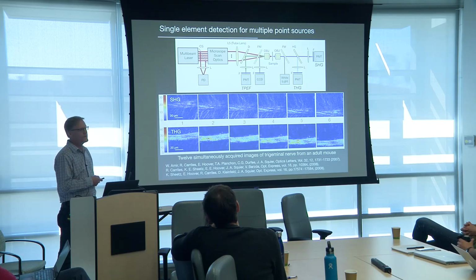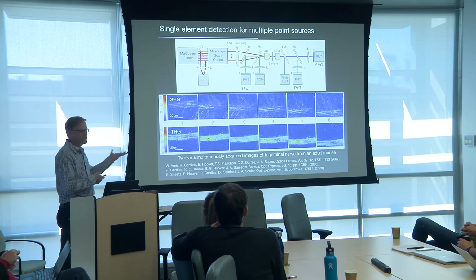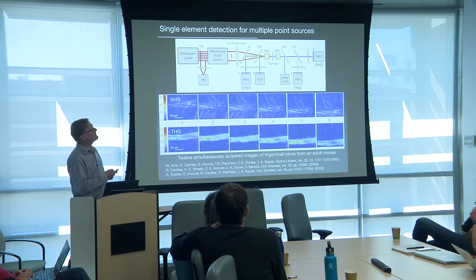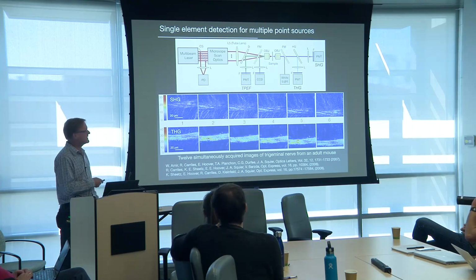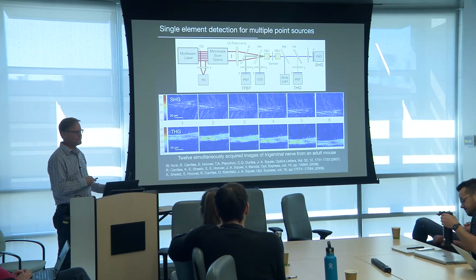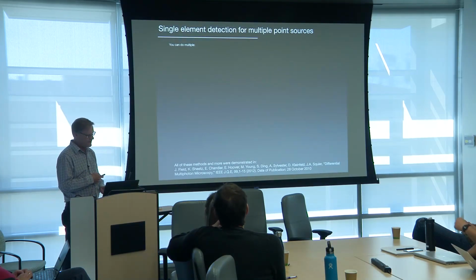Is that autofluorescence you're looking at? So this is second harmonic generation here, and third harmonic generation here. And I don't show the fluorescence channel. These are label free. For most of the fluorescence we didn't do it, but the fluorescence was usually with a label. Okay. So this is kind of neat, and we got quite a ways with all this stuff.